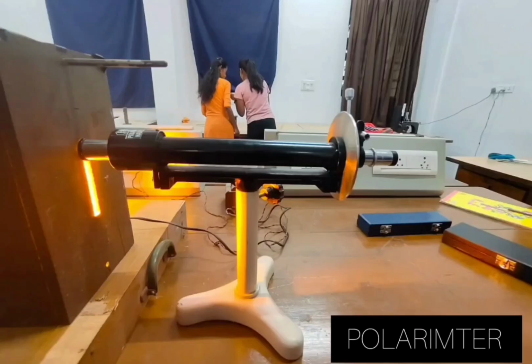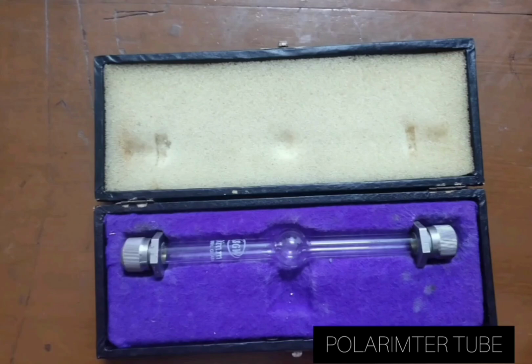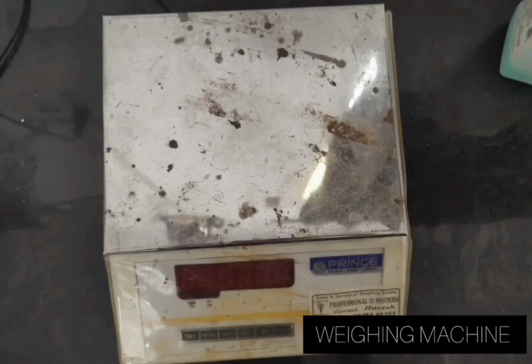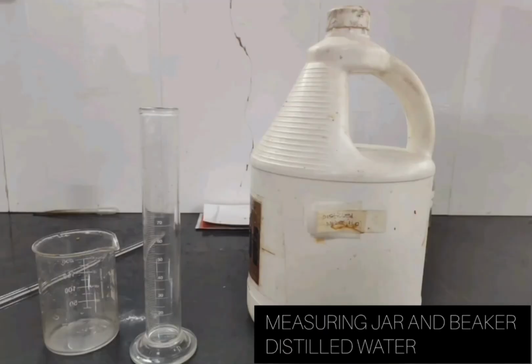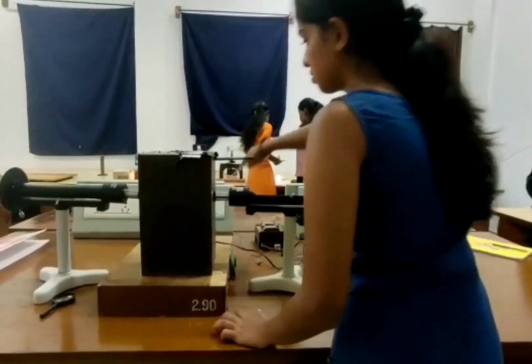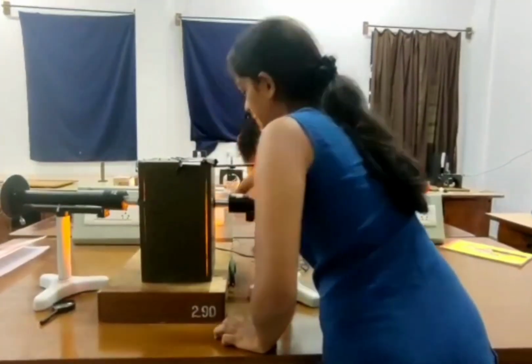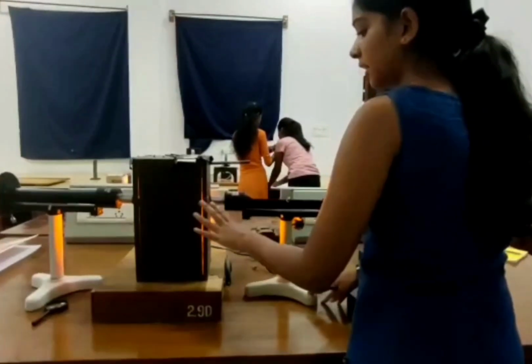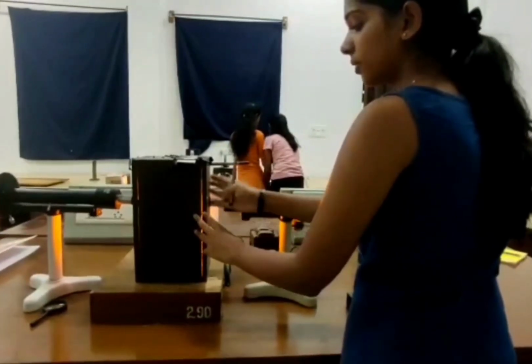Let us note down the requirements: polarimeter, polarimeter tube, sugar, weighing machine, measuring jar and beaker, and distilled water. Now, coming to the initial adjustments. Switch on the monochromatic light source, and the polarimeter should be kept close to the source of light.